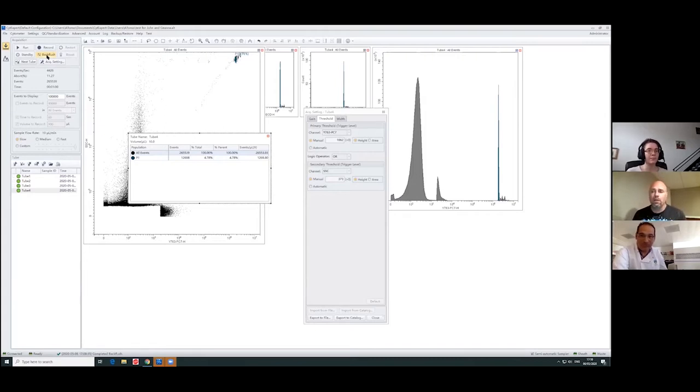And then the most common one that I'm sure most labs have is EBV. So if you can find someone with mononucleosis, just take their blood and culture it for years to come. I don't suggest infecting someone with it just to get samples. No, it doesn't comply with your IRB, but technical difficulties, right? But yeah, most labs, if you have a virology lab next to you, you can get these things, or you can get them commercially, and you have the added benefit that the people doing it commercially are doing the quality control for you. You're not worried that Tom across the hall let his virus cultures run wild and he's like, oh yeah, here you go, I think this one is an HIV, probably non-infectious. Here you go.